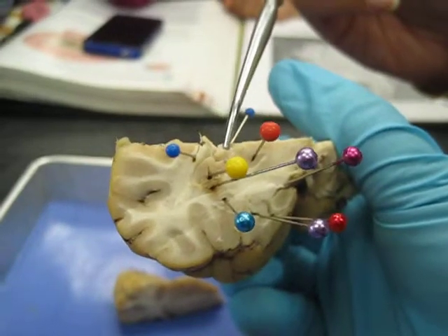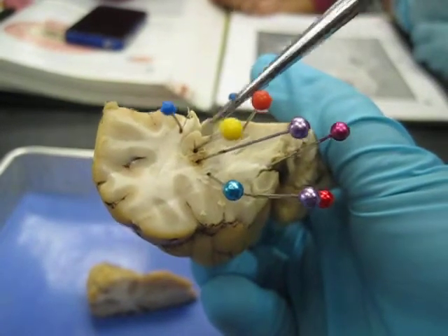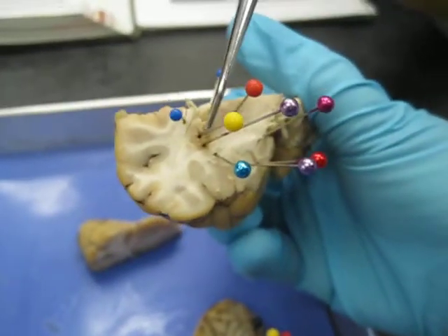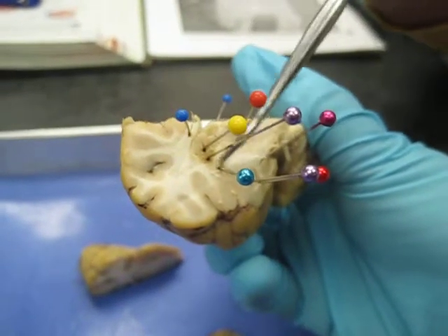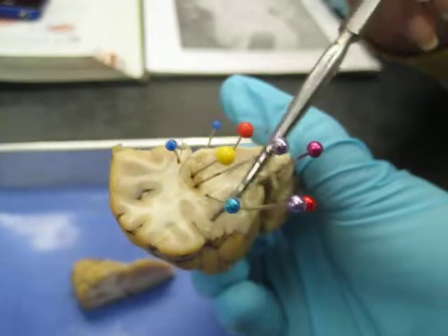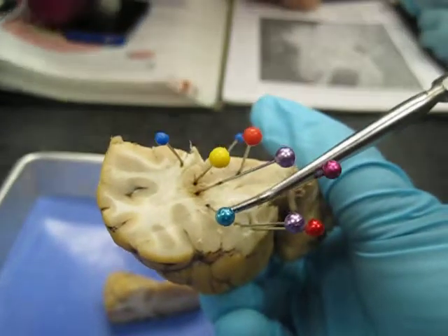So basically you just see, what's this again? Corpus callosum and the fornix. And what's this space? Lateral ventricle. Which horn is it? Frontal. And then you have lateral ventricle over here, temporal horn. You would have a septum pellucidum, right? The gray stuff next to the lateral ventricle is the caudate nucleus, and then you have this white stuff. Internal capsule. And then after the internal capsule, the next gray stuff that you see out here is the lentiform nucleus. That's the purple one? Or the blue? Blue one. Probably more the blue. Okay.